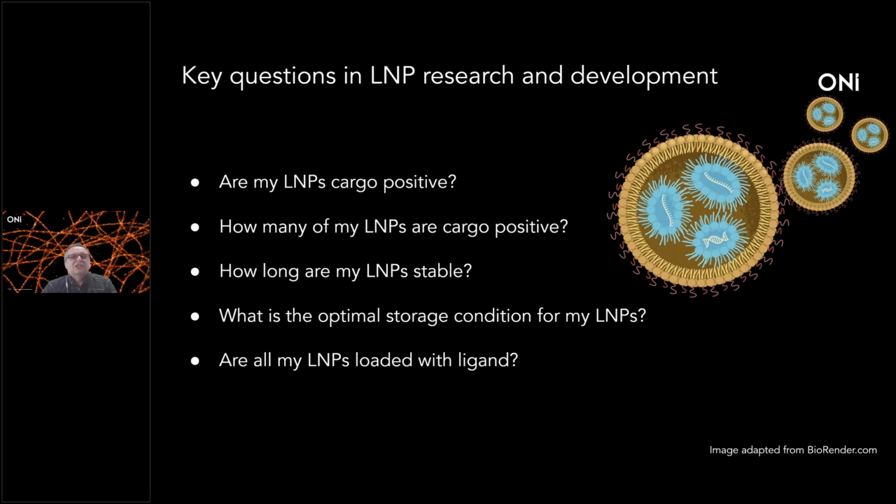One of the questions is, for example, are my LNPs cargo positive? When you are loading or encapsulating your lipid nanoparticles with RNA, you mix, and during your process, you don't know how many of your particles are RNA positive. If you don't do any cleanup process, then measuring the RNA content within the particles, the free RNA in your solution will contribute to that information.